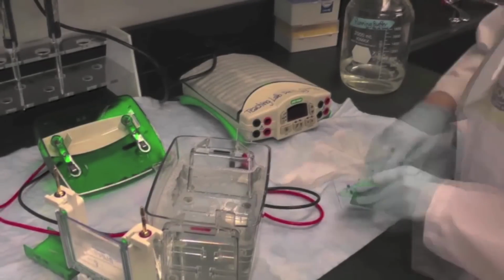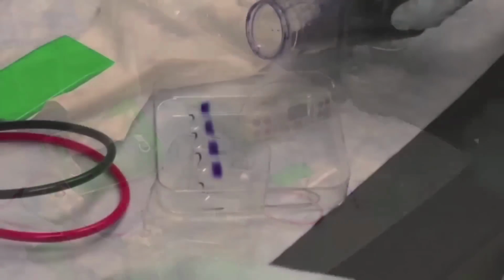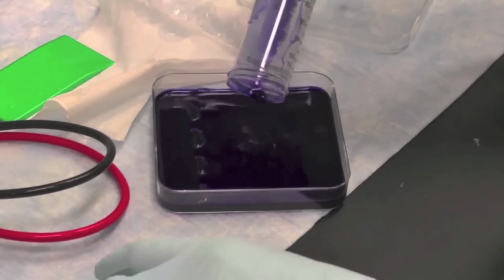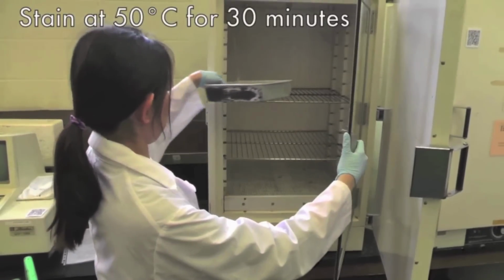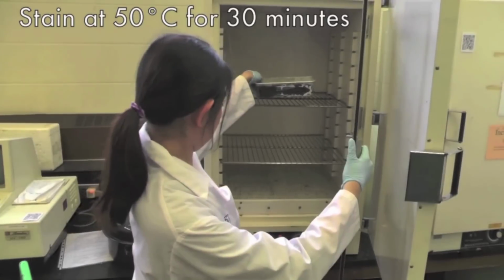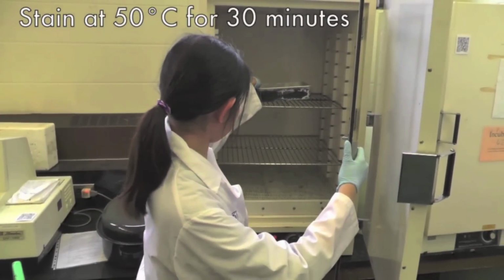Transfer the gel into a square petri dish. Then pour the Coomassie Blue staining solution into the petri dish, submerging the gel fully. Place the square petri dish into a metal tray to avoid spillage in the incubator. Then place in a 50 degrees Celsius incubator to stain for 30 minutes.